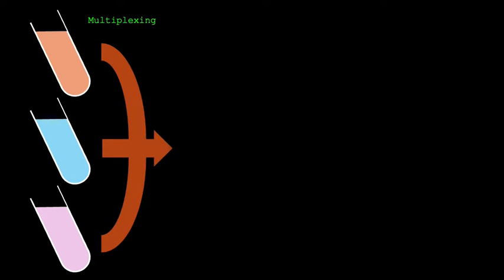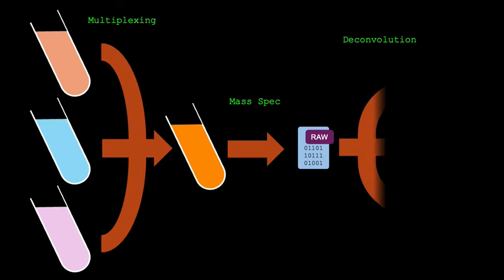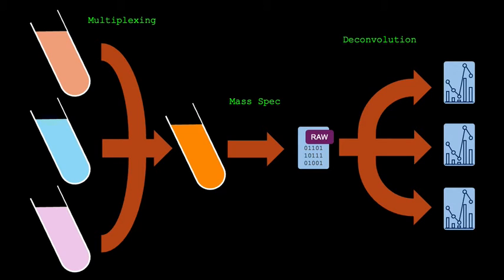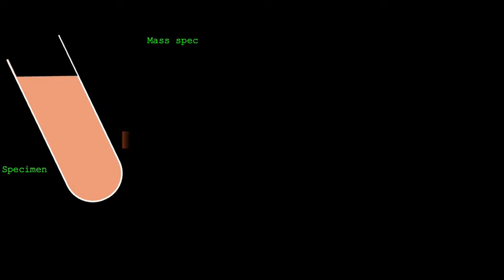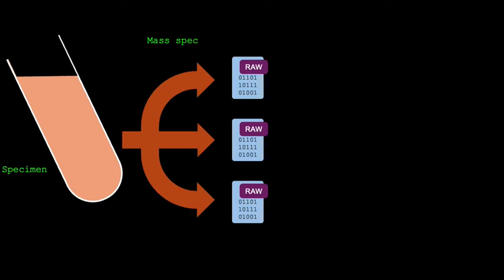What kind of mass spec data will not work with COMPAS? Any files where multiple samples are subjected to mass spec in tandem, as with TMT labeling, will not work with COMPAS. COMPAS needs separate mass spec files for each sample. However, this point highlights another key difference of working with COMPAS, namely the ability to perform integrated analysis of multiple mass spec based omics types.